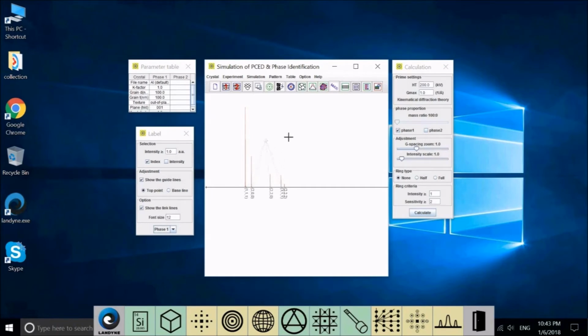Suppose we select to this point, and we select another one, the baseline, and again click on the display area, then again we use the arrow key, and then we can see the label positions are changed due to the top point and the baseline.